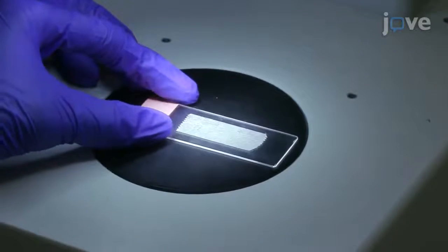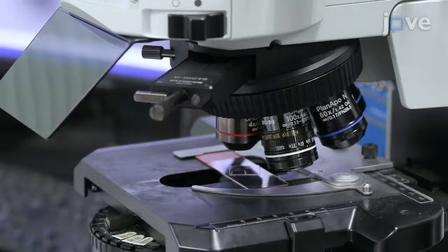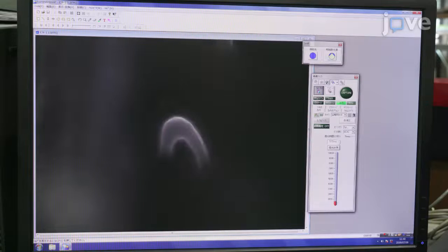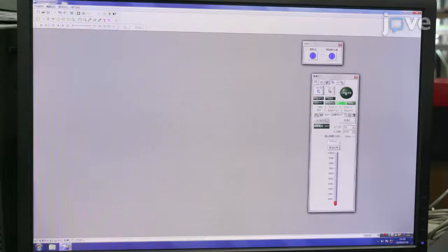This protocol provides a way to assess the involvement of a certain factor in double fertilization of Arabidopsis. The fertilization status can be judged by the morphology of the sperm nuclei at a glance, so the quick obtaining of the data for statistical analysis is possible.